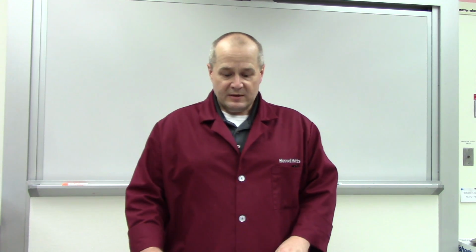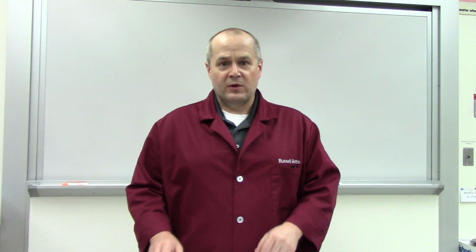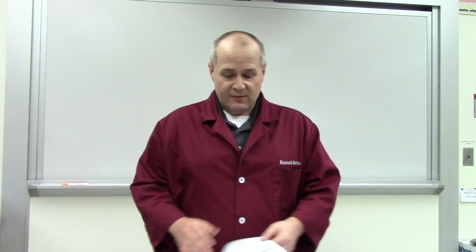Part two, we'll be examining the difference between cis fatty acids and trans fatty acids. You've all heard the terms on the news, I'm sure, cis fats and trans fats, so this is going to give you a little bit of an idea of where those names come from.